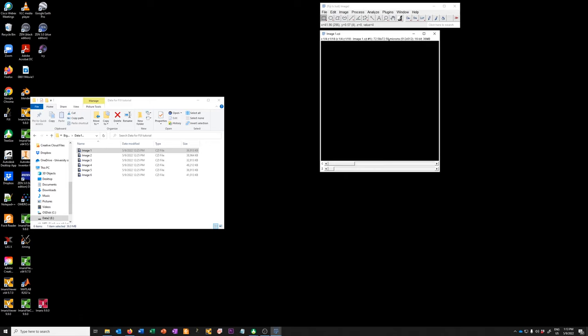We can't see anything yet — just a black square. There are two sliders: one for C (channel) and one for Z (z-plane). If we move the Z slider we can see there is something in the middle in each channel. You can move through the different z-planes of a given channel using the Z slider. But why do these things look gray? Didn't we acquire different fluorophores?